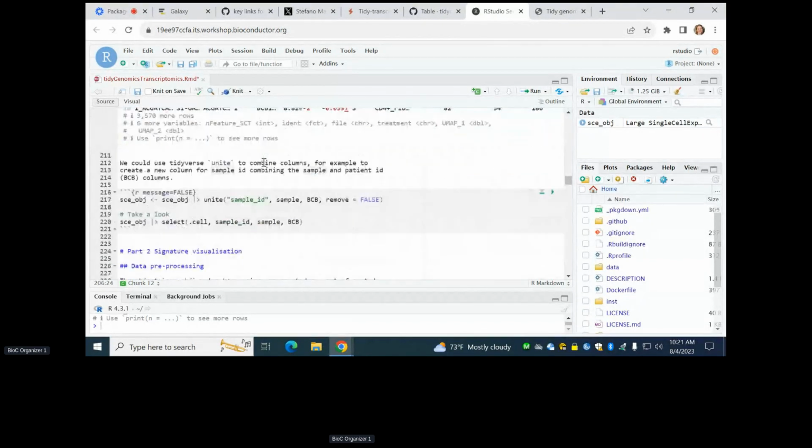Yeah. You can do stuff like arrange and reorder, and it'll reorder the whole summarized experiment or the. Well, to be specific, single cell experiment in this case, yes. Summarized experiments we don't allow because we integrate transcript and sample, which is complicated. Yeah? But in this case, yes, there is no issue with doing that. You will reorder the cells based on whatever you want. And again, many of these could be transitive. You just do stuff to observe or display. Not all the time you arrange do you want to actually save that order. You can do many things on the spot.